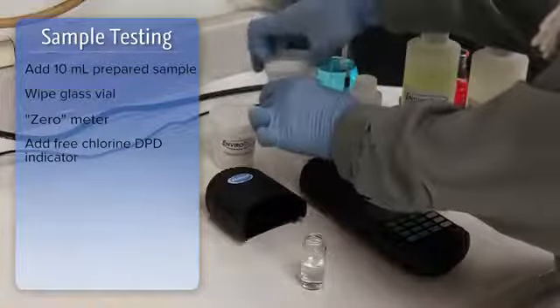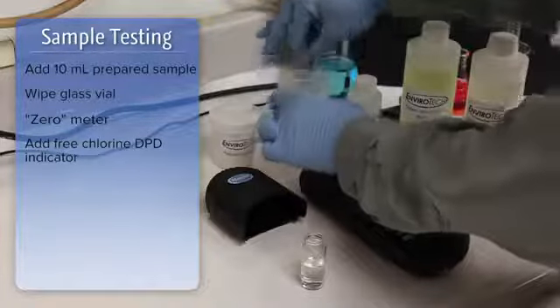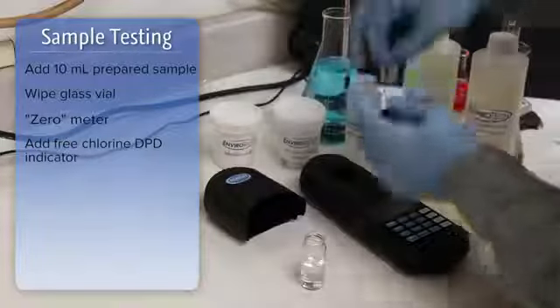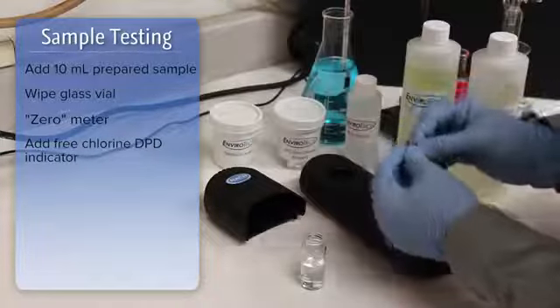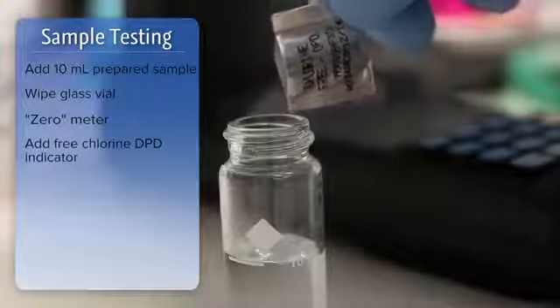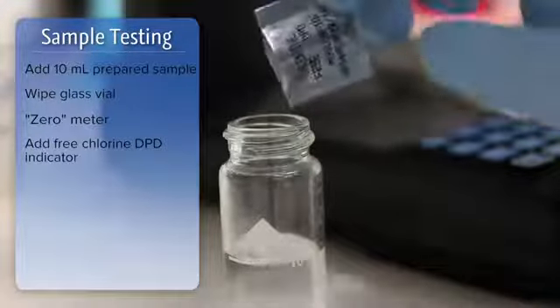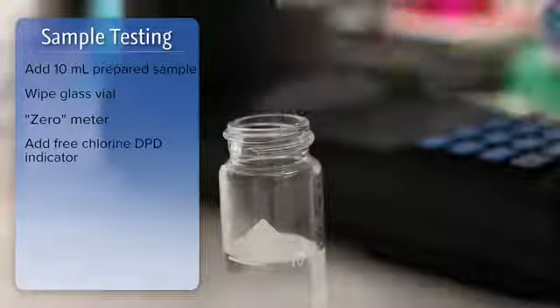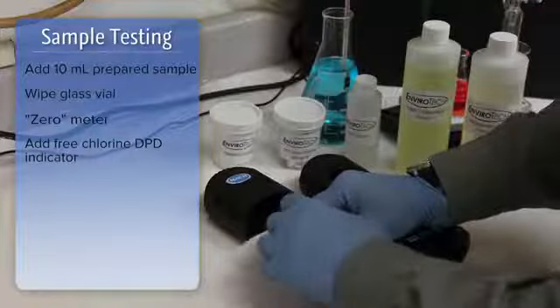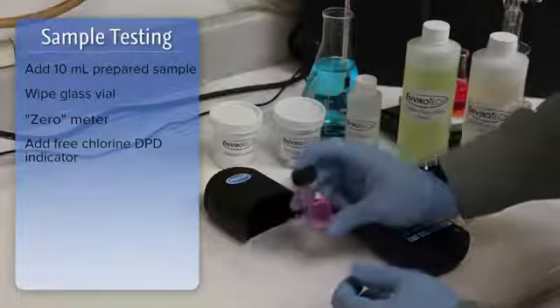One pack of DPD free chlorine reagent. It is very important to use the DPD free chlorine reagent at this stage. Do not use DPD total chlorine. Shake to mix.